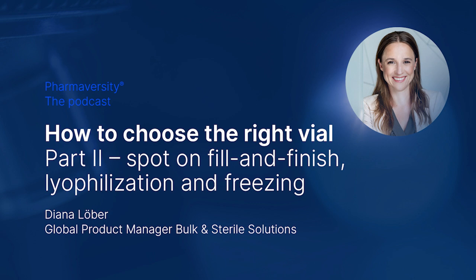Okay, but this also means that the breakage could occur at some later stage along the value chain, right? So exactly, Jan, you are totally right. It might also happen when a nurse or even a patient himself or herself uses the container. And it could even happen if, for example, a device is used. So even though it is rare that a vial is used in a device that actually injects the drug directly, it is quite common to use adapters to do the reconstitution of lyophilized vials or to get the drug transferred into a syringe. And are there any other occasions that pose a higher risk for breakage?